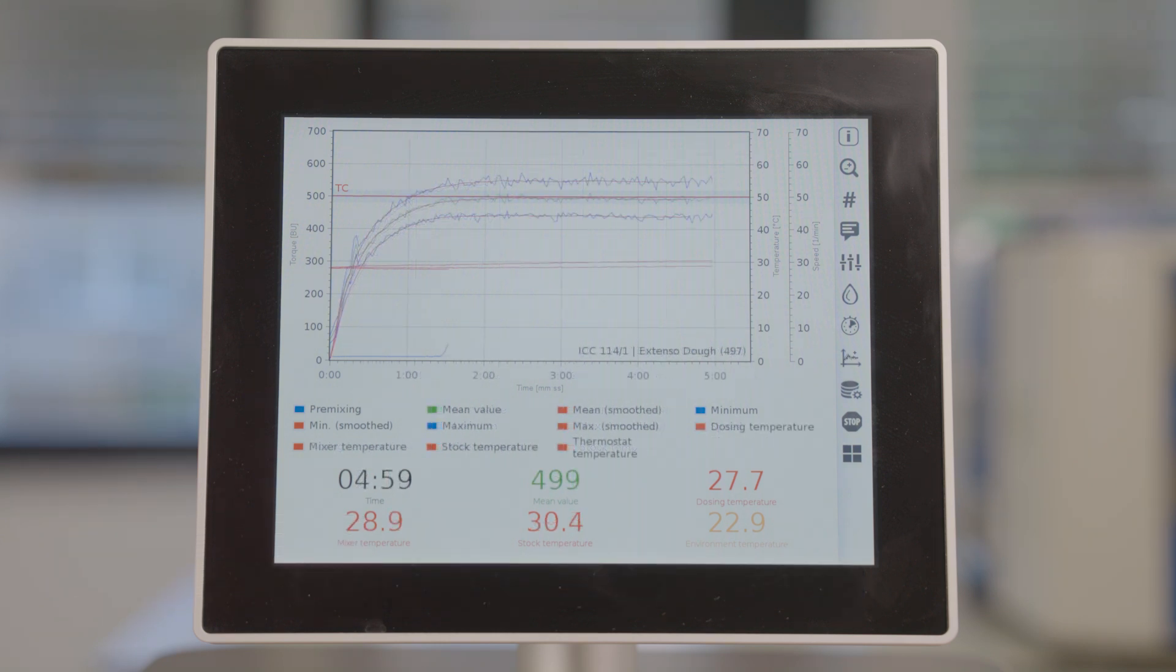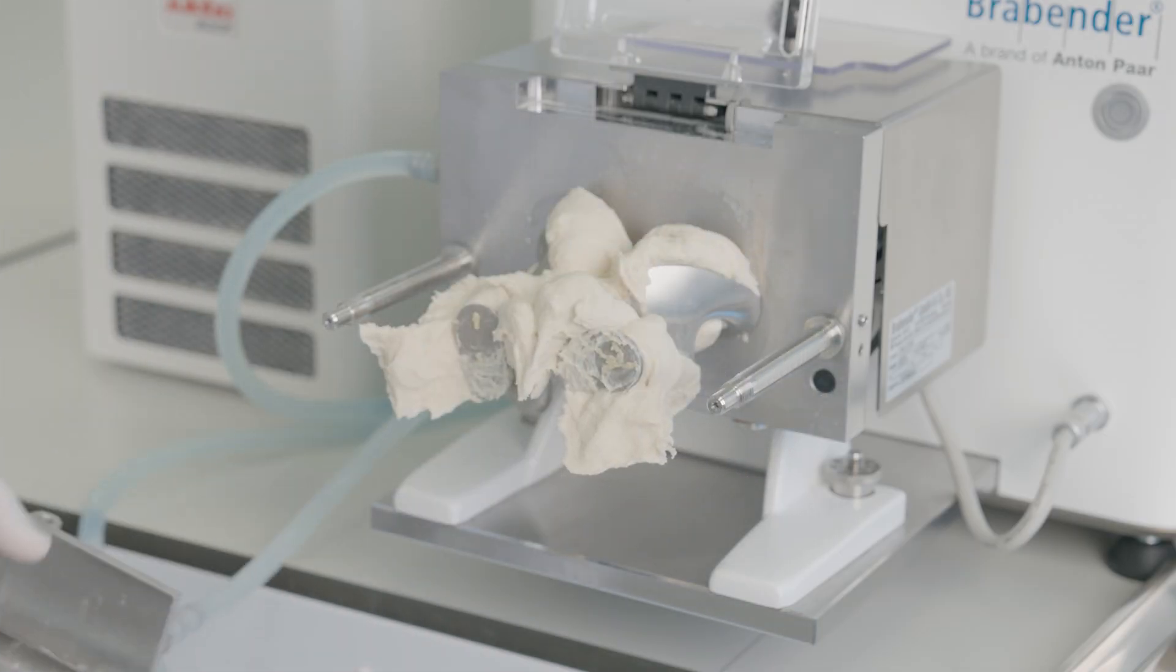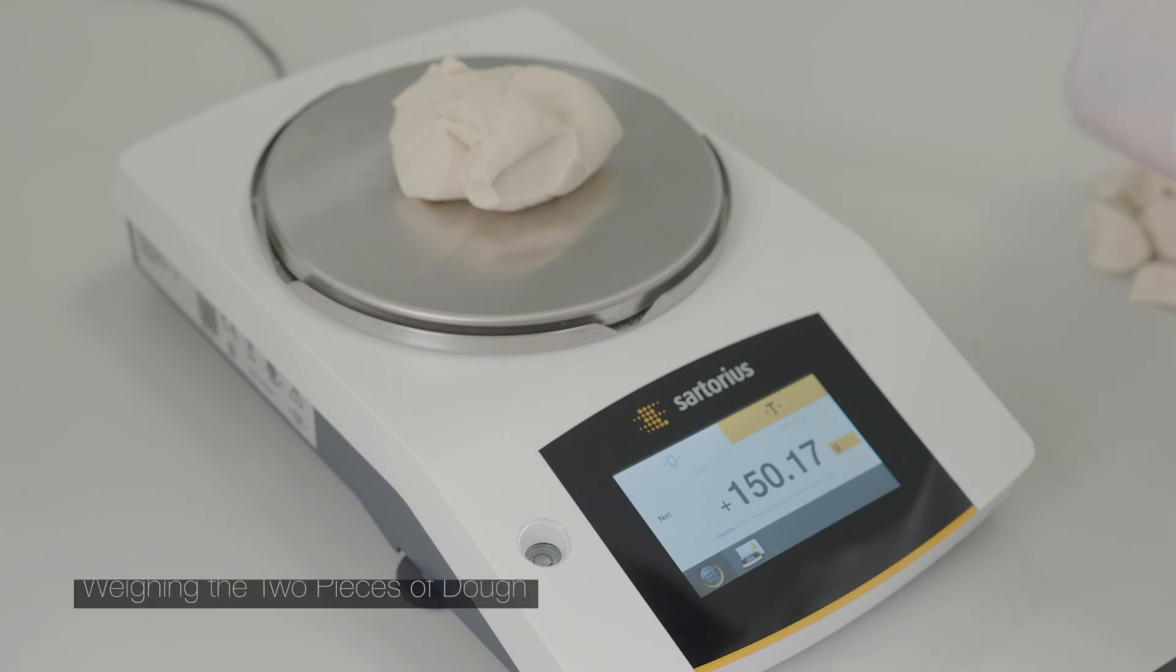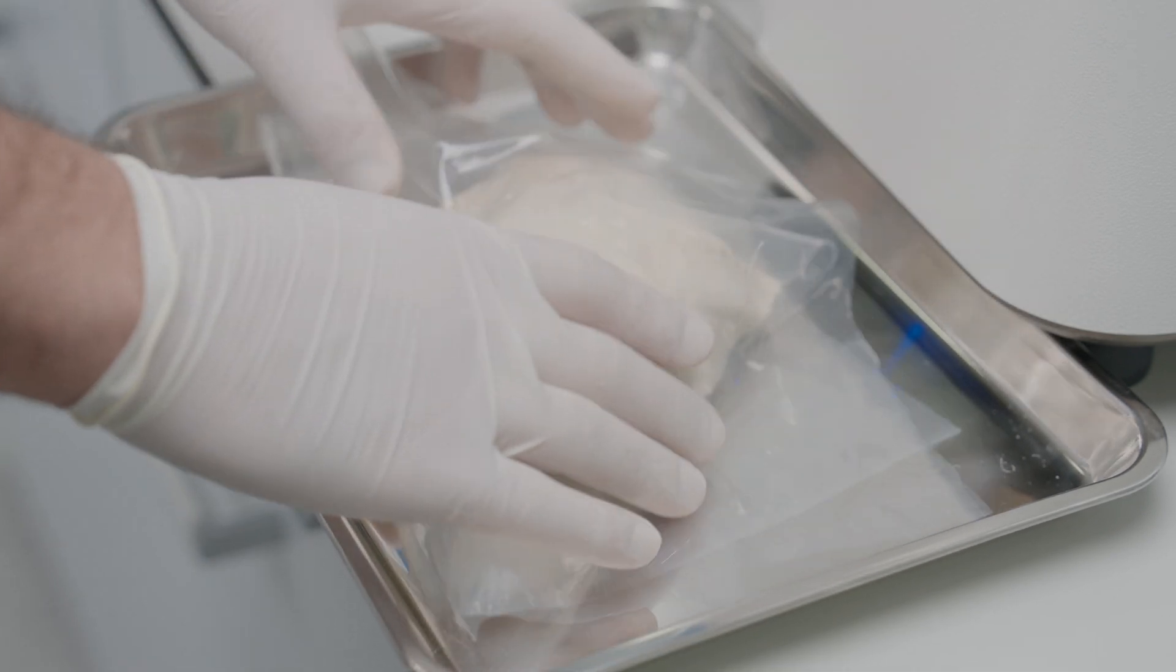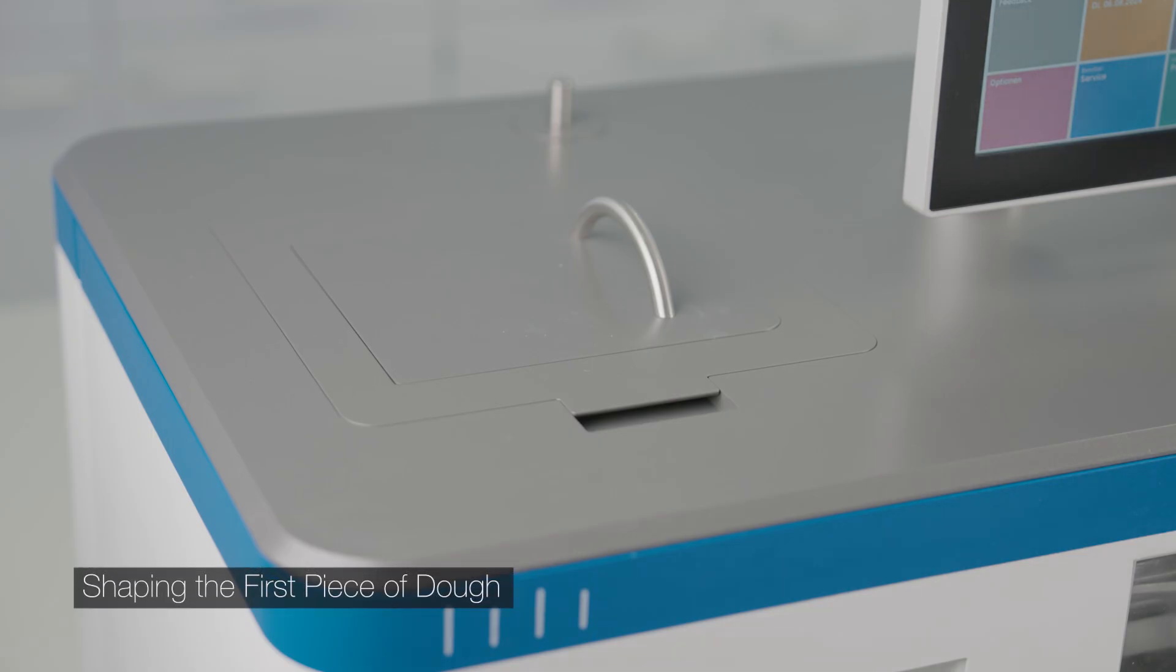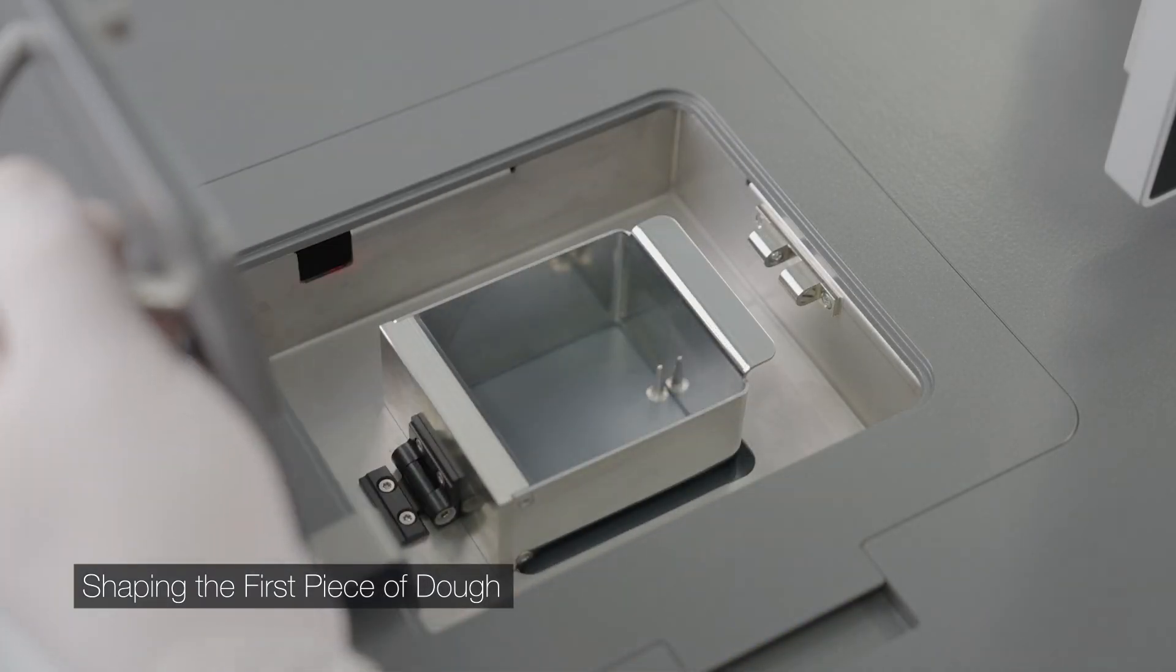The instrument stops automatically. Open the mixer and remove the dough. Cut two pieces of 150 plus or minus 0.5 grams, as extensograph measurement is duplicated with two pieces. Wrap one piece in foil while preparing the other to prevent it from drying. Place the dough in the dough shaping box.